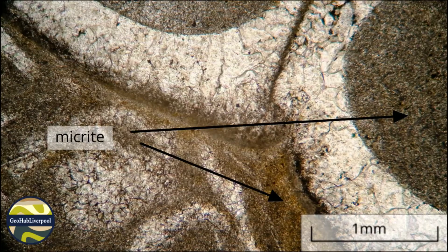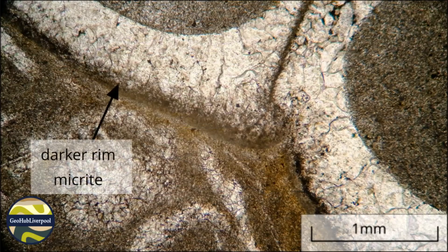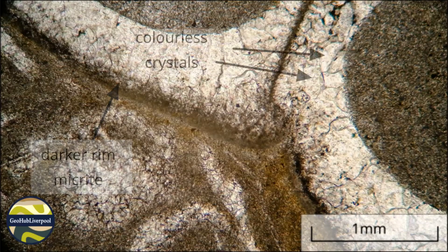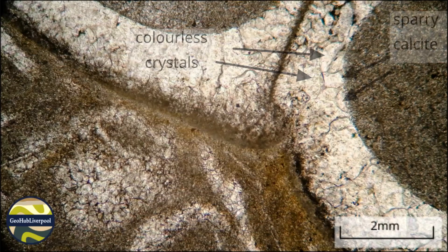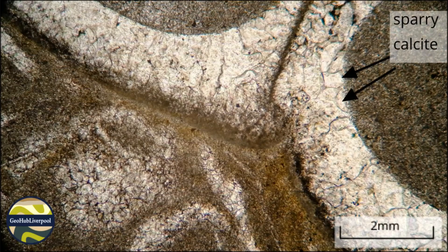Note that there are darker rims on the outer margins of the larger shell. These rims are also made of micrite. Many of the skeletal grains are unbroken. These bioclasts are composed of a colourless mineral which has moderately high relief. This mineral is calcite, and it is possible to see the outlines of the sparry calcite crystals even under plain polarised light.